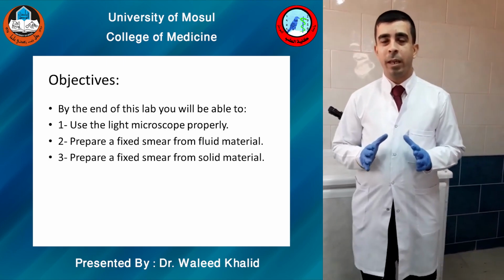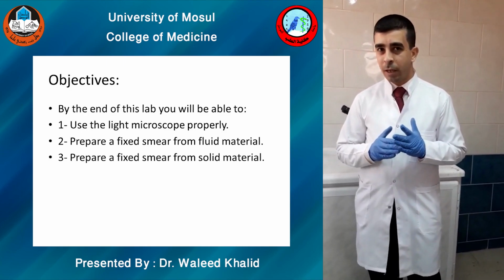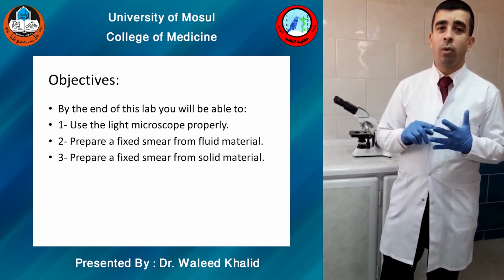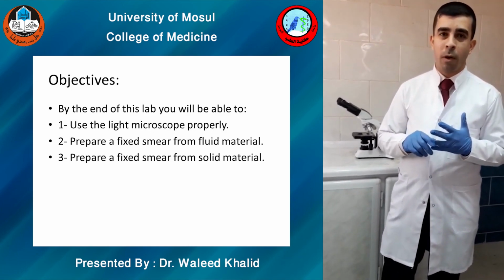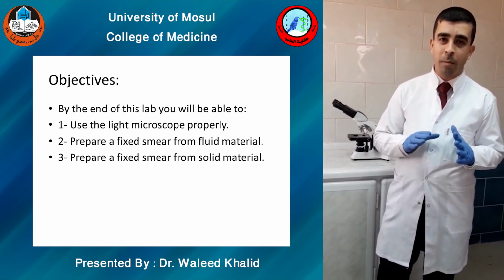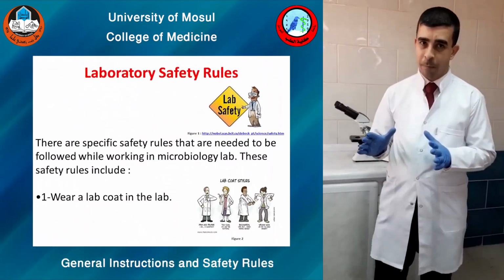Our lab today includes three important subjects. First of all is the microscope. Second, how to prepare a fixed smear from fluid material. And third is how to prepare a fixed smear from solid material.